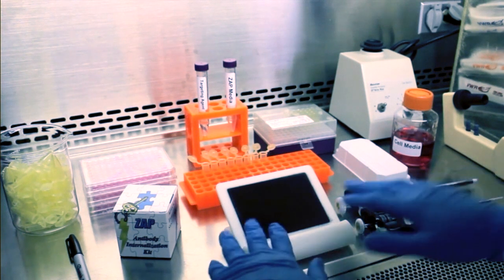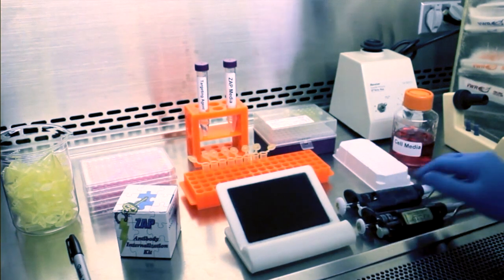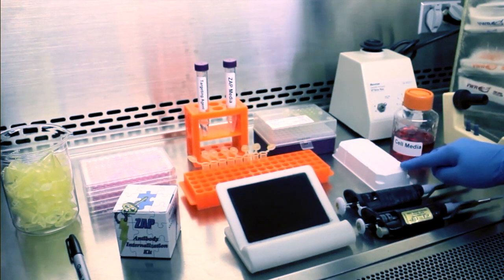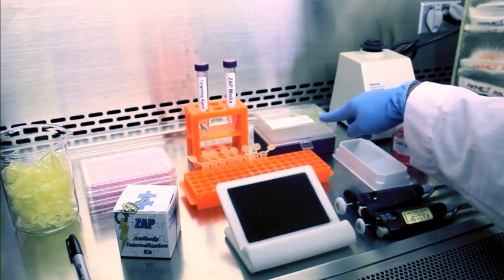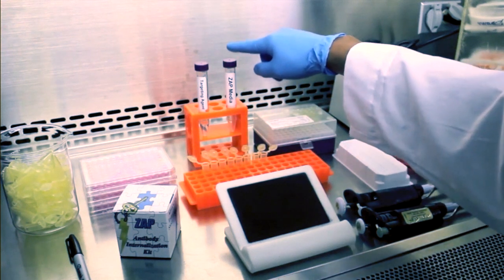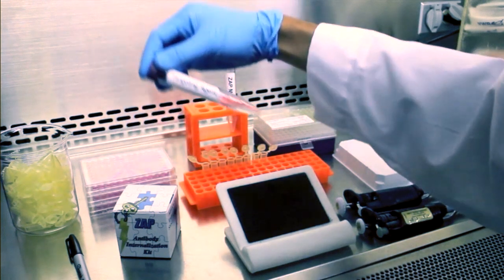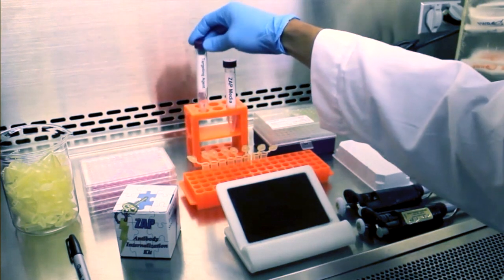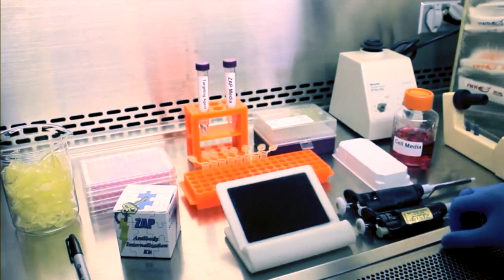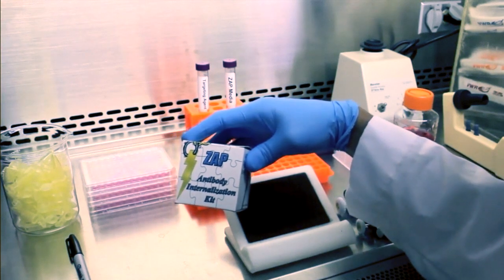The things that you will need are a well stand, which is optional, pipettes, cell media, well reservoir for the cell media, tips, microcentrifuge tubes, a 15 ml tube labeled ZAP media, your targeting agent, the plates containing the cells that you plated in the previous afternoon, and, of course, the ZAP antibody internalization kit.